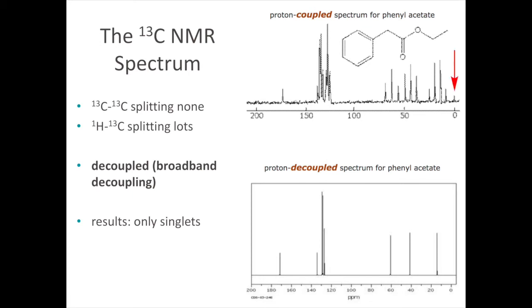spectrum. And another feature of the spectrum is the chemical shifts.